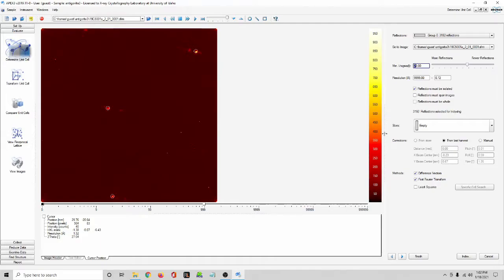And as you saw, the sublattice reflections are more intense, so we're going to put a higher threshold for those. So I'm going to set it at 40. Index in these two, we're using the gray group, and we're going to store the unit cell in the gray. We may have to rearrange these later on, but that's okay. Hopefully we get a good sublattice from this threshold.